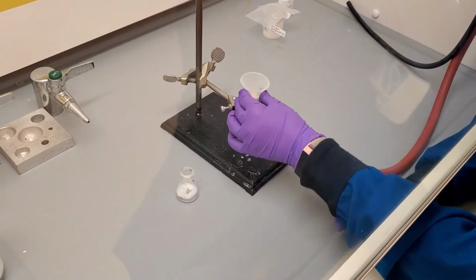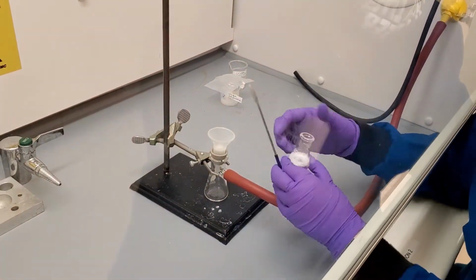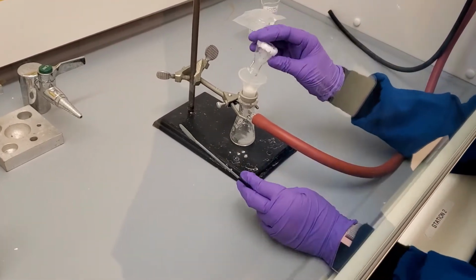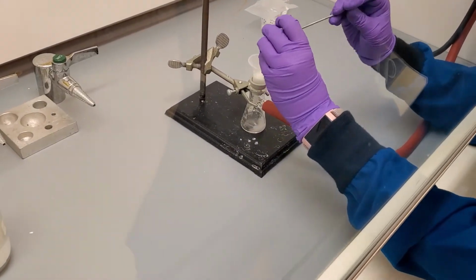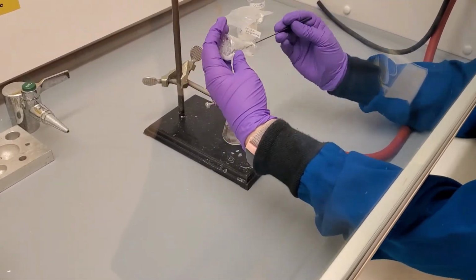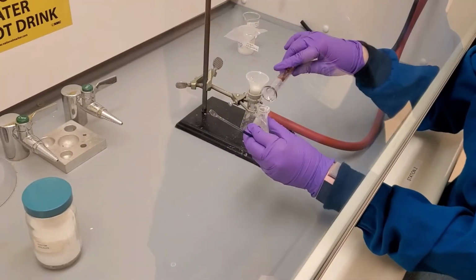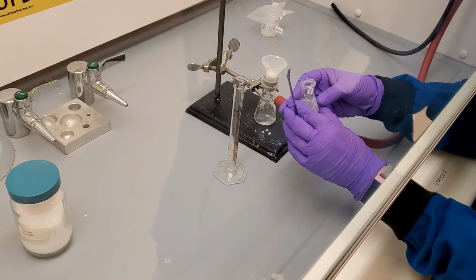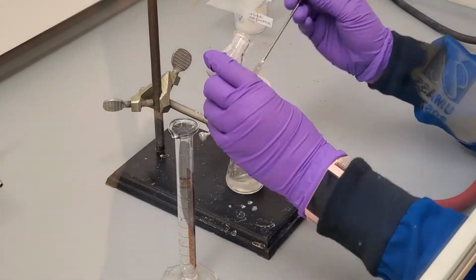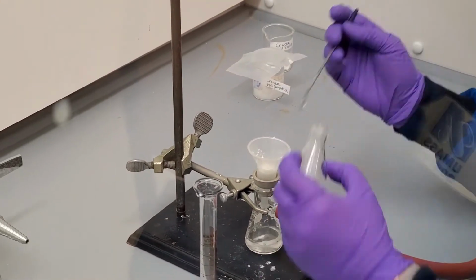We turn on the vacuum and slowly pour the contents of the Erlenmeyer flask into the Hirsch funnel. Using a spatula, scrape as much of the product into the Hirsch funnel as you can. In order to get the remaining precipitate out of the reaction vial, we cooled an additional amount of deionized water in the ice bath and used it to rinse the vial and pour the contents into the Hirsch funnel. This will also help rinse out any ionic impurities in the product.